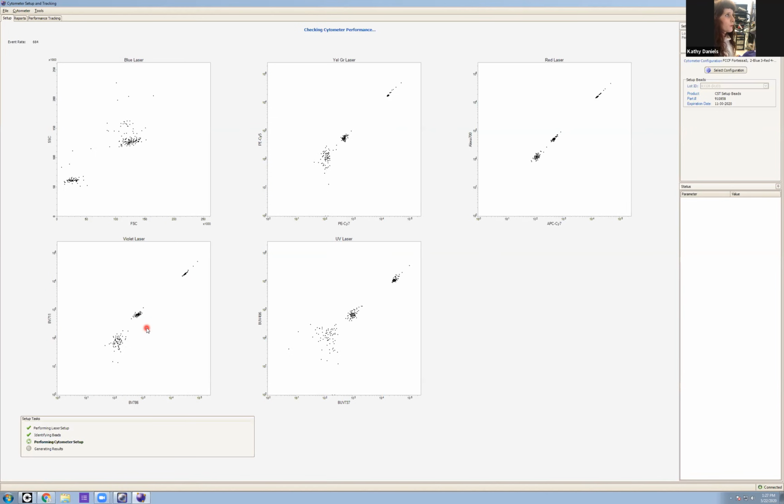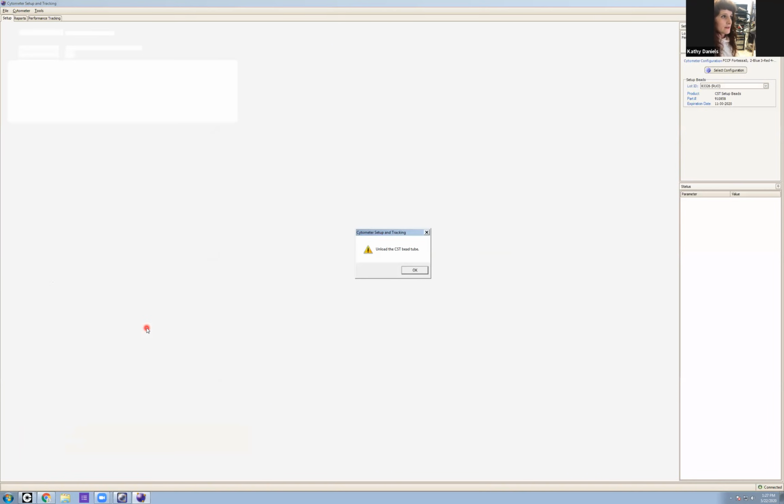So it's important for us to understand why we're actually carrying out this CS&T performance check and what the instrument's actually doing. So we have the baseline that we're defining, typically once every 6 months, like I said, or at any major interventions or PMs. And then our daily check of the QC itself is done with a performance check.